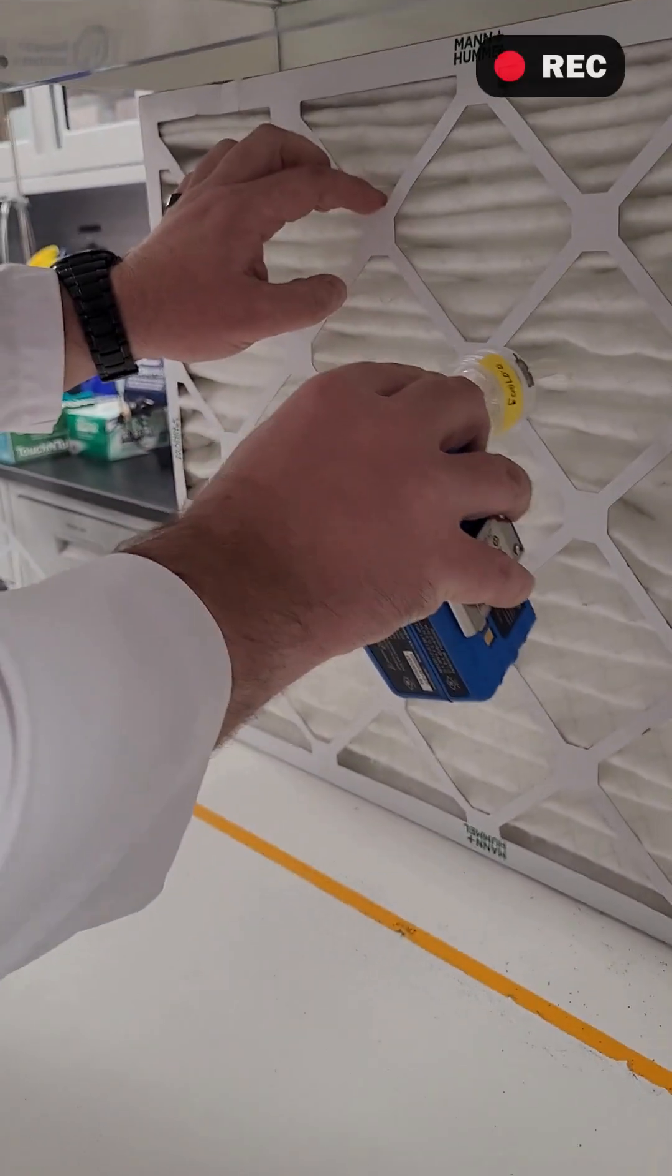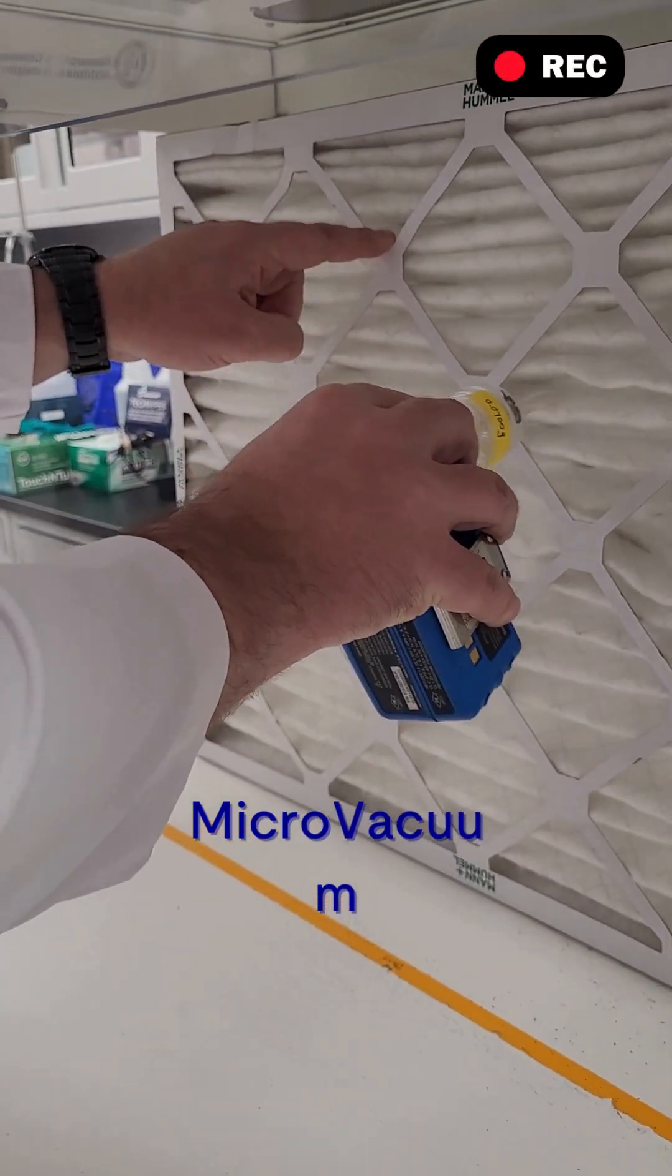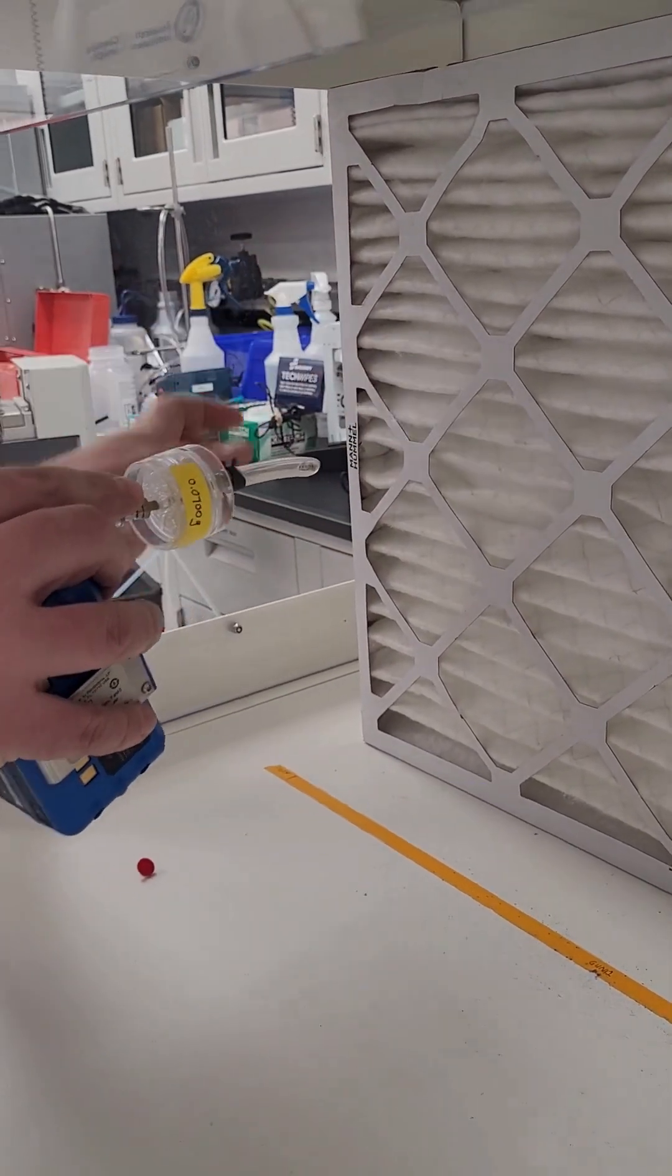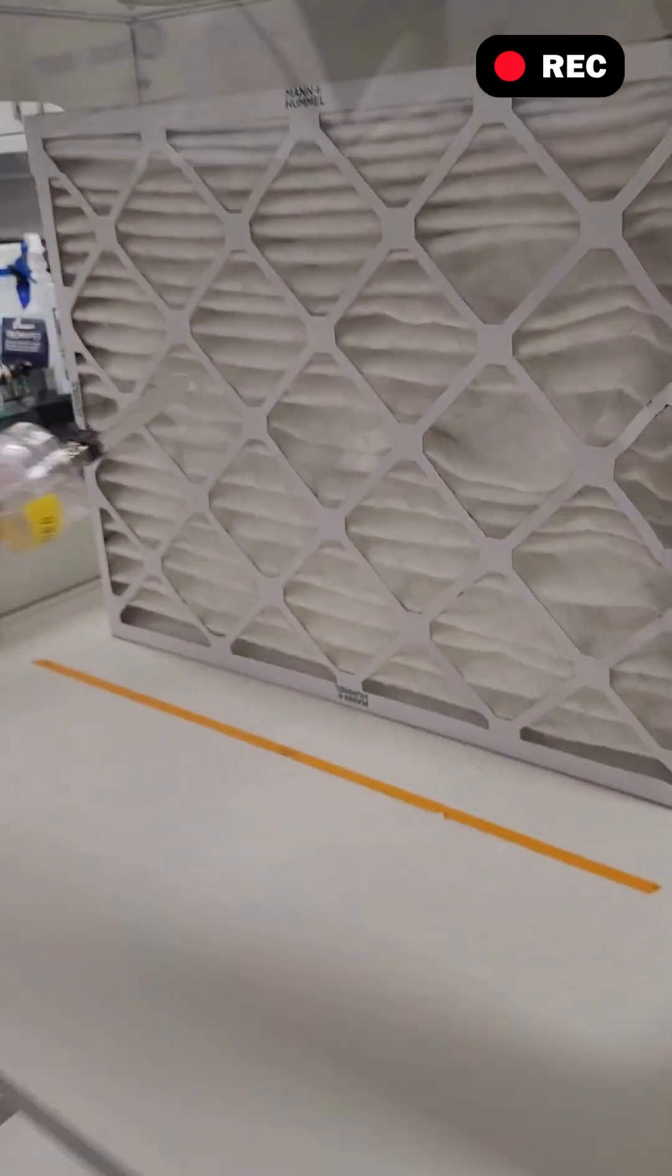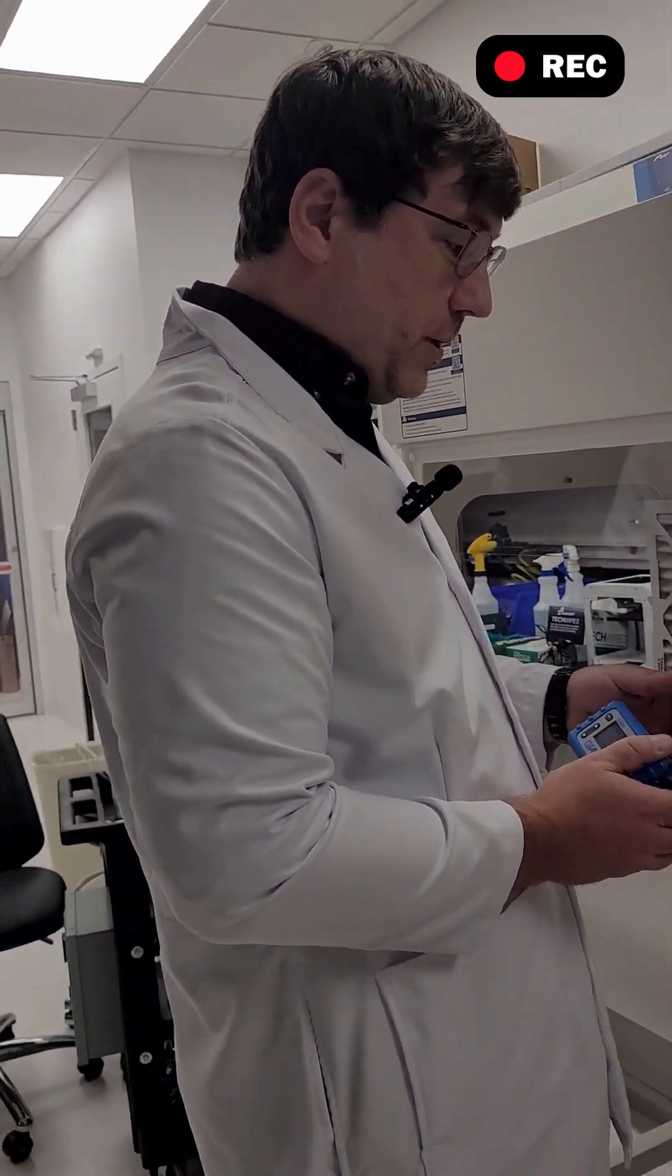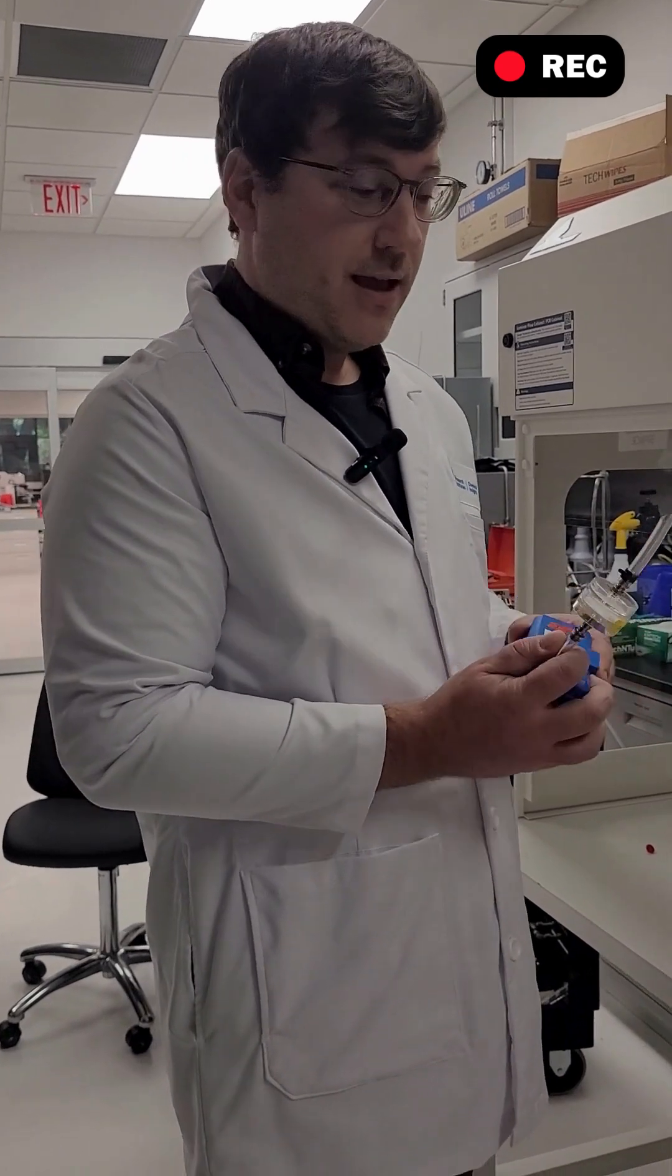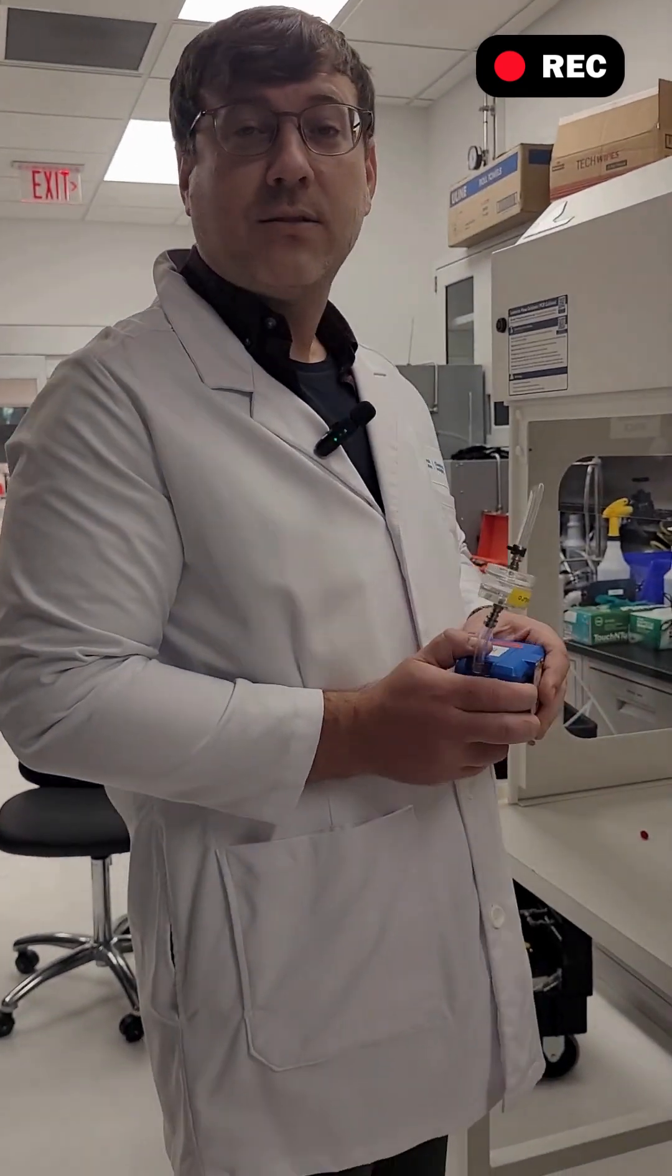I'm gonna go back through and get samples at points two, three, four, and the rest on the bottom: five, six, seven, and eight. Those eight sample points will be enough for us to analyze through ICP-MS and also look at the toxicological impacts of the particulate.